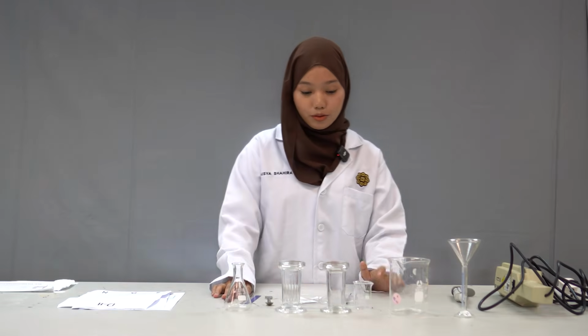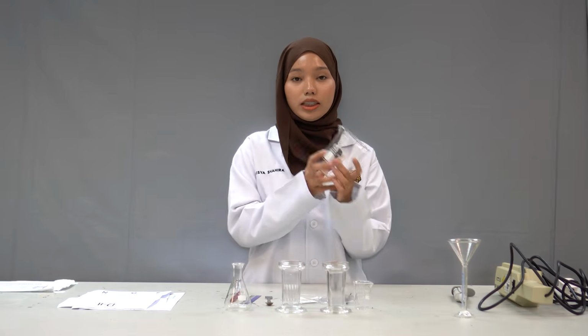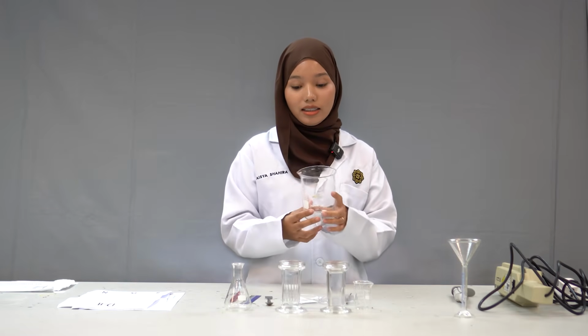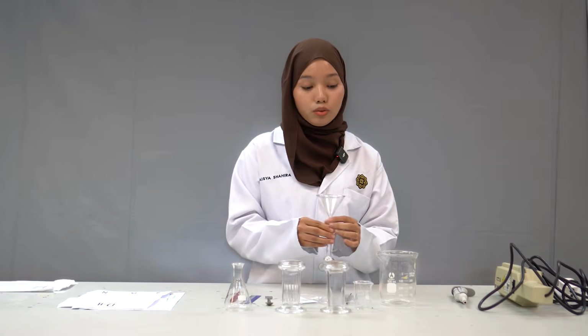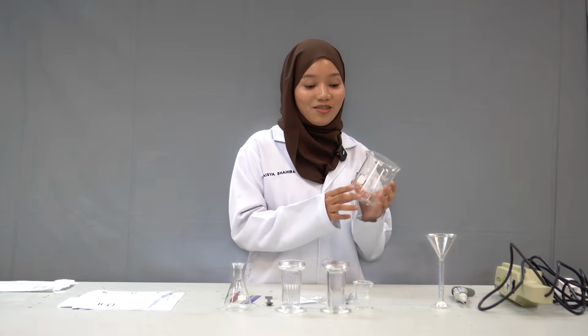Next we proceed to produce the sample solutions using 3 separate beakers. We label the beakers A for acid, B for base, and N for neutral. Then we use a measuring cylinder and filter funnel to put 5 ml of dichloromethane into each beaker to dissolve each compound, and put them aside for spotting later.